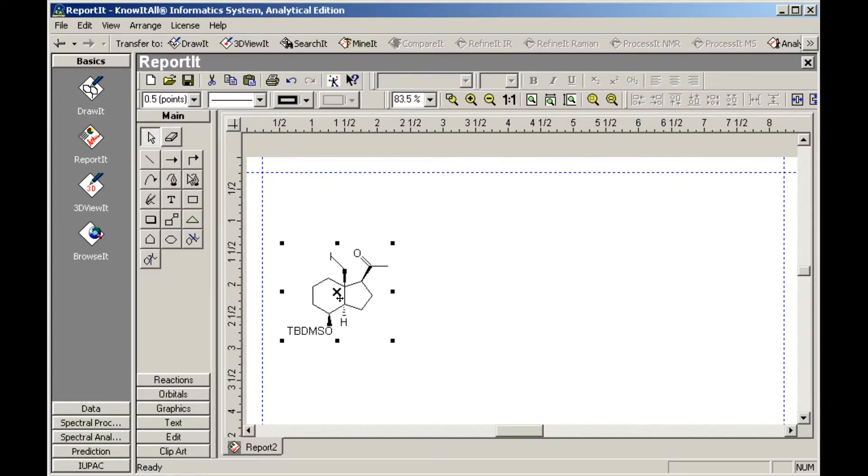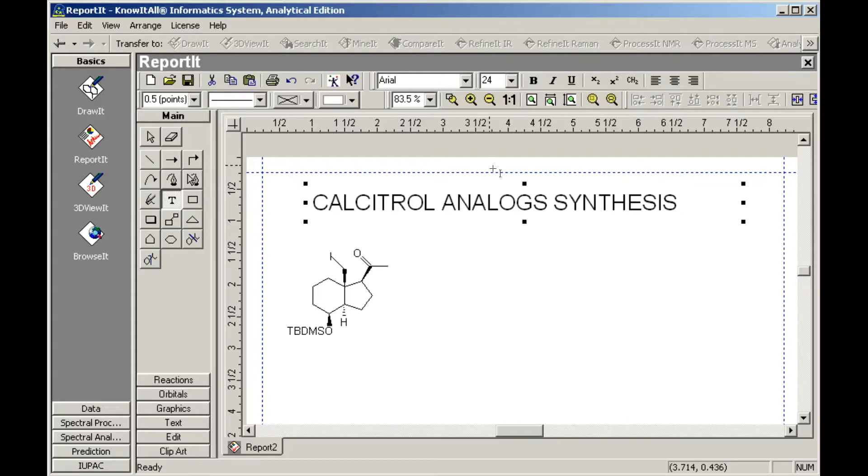Now we'll use the Text tool to add a caption to the page. Select the tool, then click and drag to create a text box. Adjust the font size, then begin typing. Use the Center Alignment tool in the Text Style toolbar to center the text within the text box.